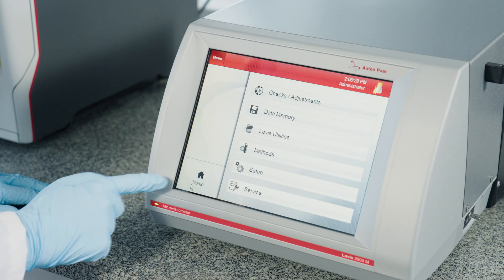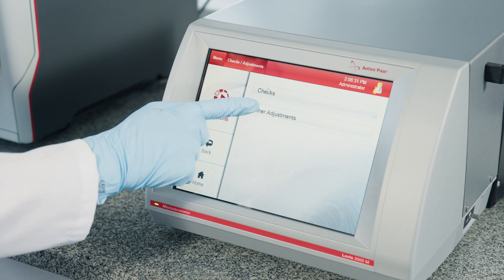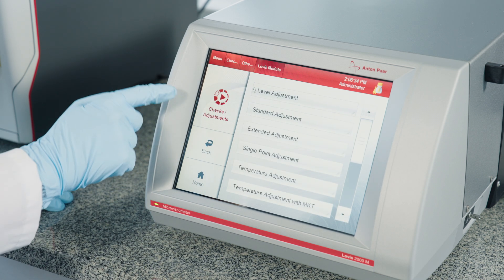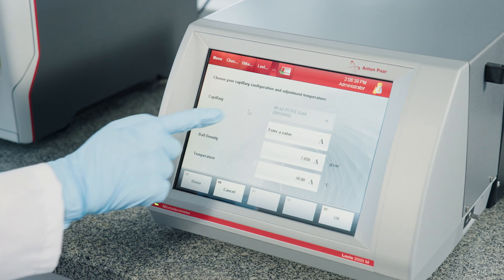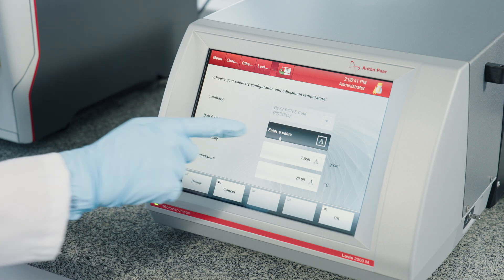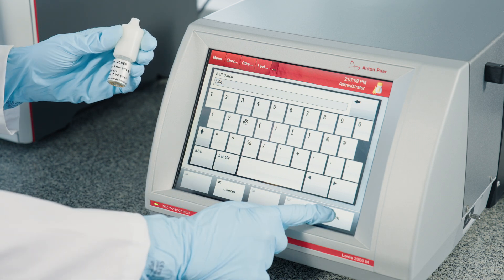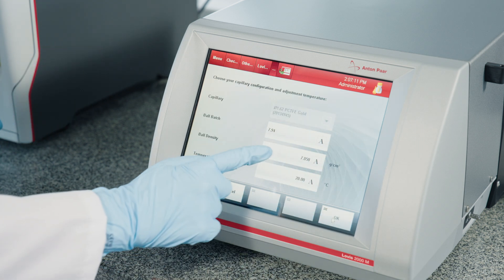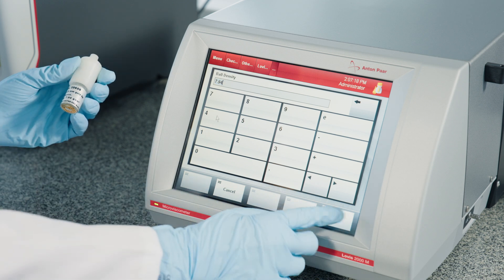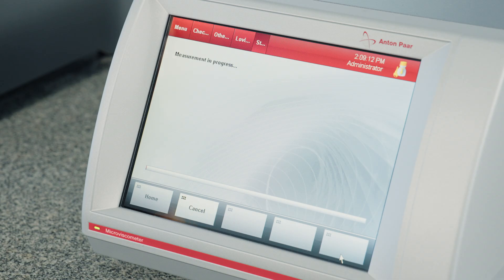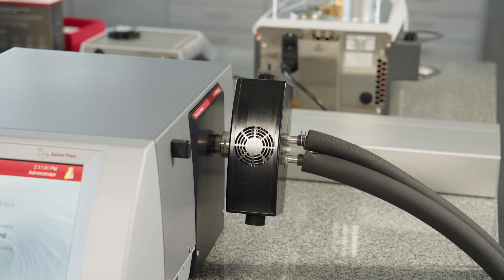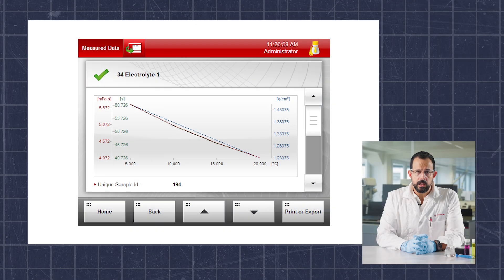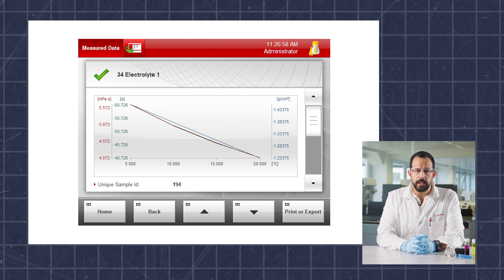The next step is capillary adjustment. The adjustment can be a single-point adjustment using one single angle, a standard adjustment which adjusts angle between 20 and 70 degrees in 10-degree steps, or an extended adjustment where the user can select at least three different angles of their choice. When doing temperature scans, a standard adjustment is recommended to allow high flexibility in selecting measuring angles. After configuring the method, the measurement can be started. At the end of the analysis, the data will be summarized in a table and plotted in a graph.